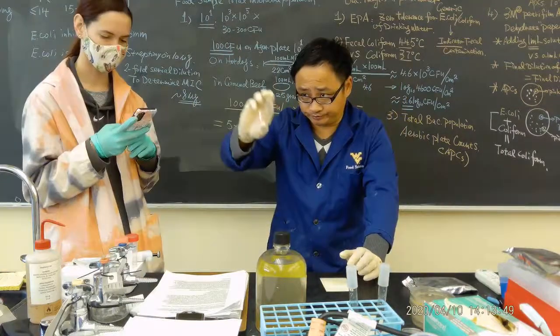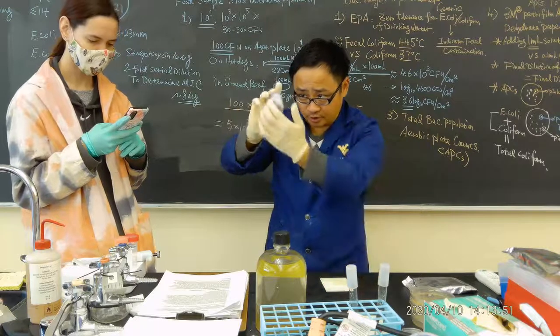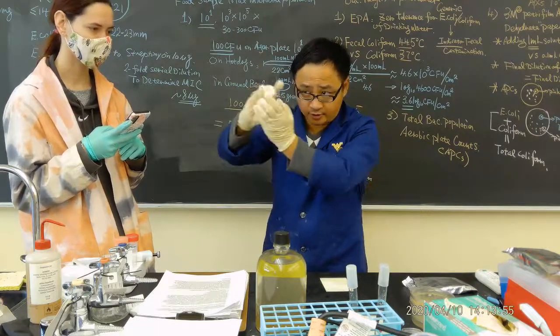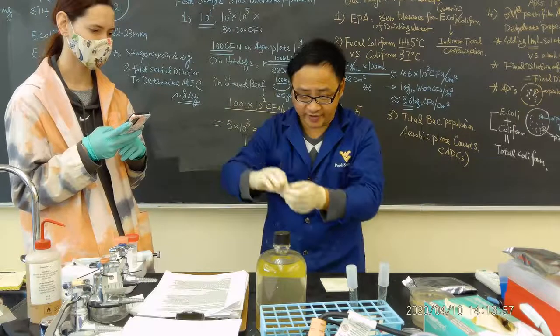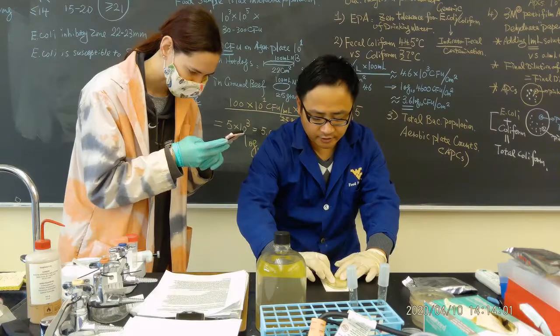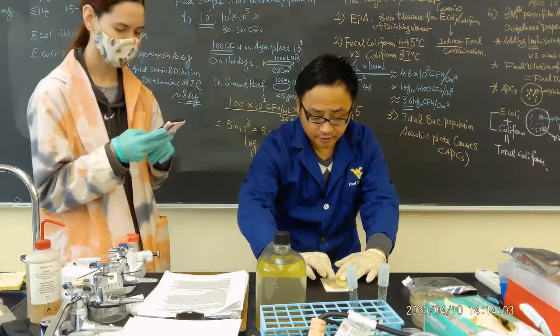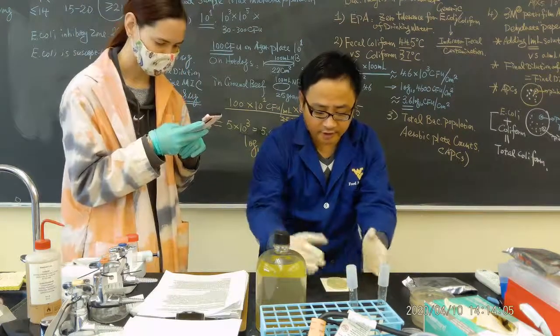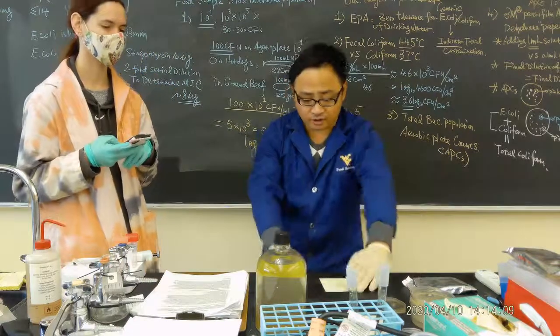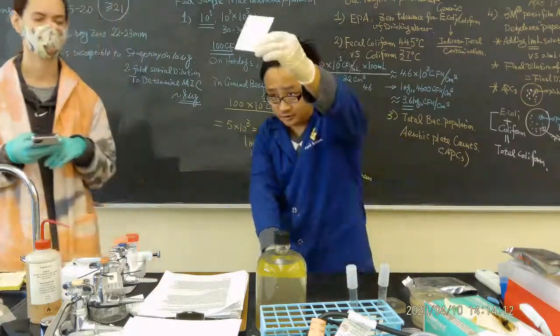This is a pressure tool. Make sure the flat side is on the top. Then you do a very gentle cover like that. You press it, let it stay a little bit, 10 seconds, then you take it out. It will be a very nice circle in the middle, like this.